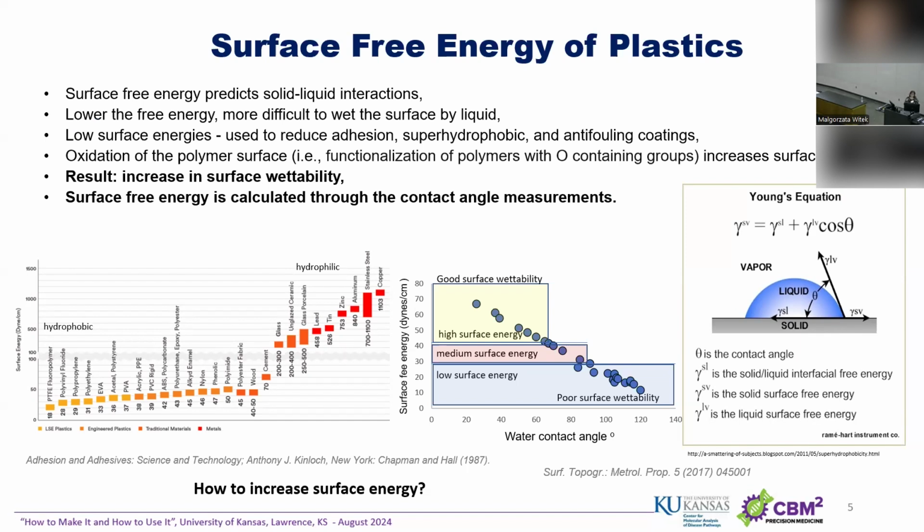We know that the lower the energy, the harder it is to wet the surface, right? It's hydrophobic. There are applications where you may work with a hydrophobic surface. You can design those surfaces to be really hydrophobic to prevent some non-specific adsorption of aqueous-based solutions. But in the majority of our applications, we actually want the surface to be hydrophilic.